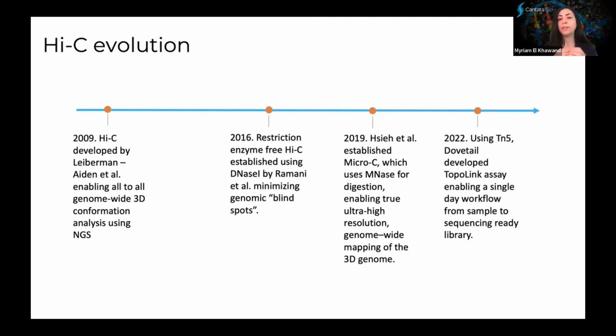So you're really limited by restriction enzyme sites. And what you end up with are sequences that are overrepresented and sequences that are underrepresented or not present in your data, because these would be regions of the genome that have few or don't have those restriction enzyme sites.